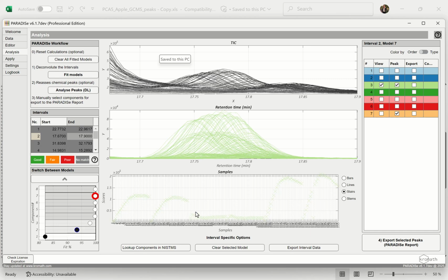There's really no good reason for why you want to set certain numbers to 0 or to below limit of detection in an untargeted, multivariate setting. You want all the quantifications. Paradise will quantify perfectly fine whether it's below limit of detection or not. It doesn't affect how well we quantify. I know that some people will not really agree on that, but it really is true, and I'm happy to debate that further. And that's basically what I wanted to show here.